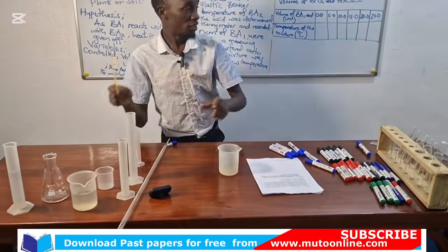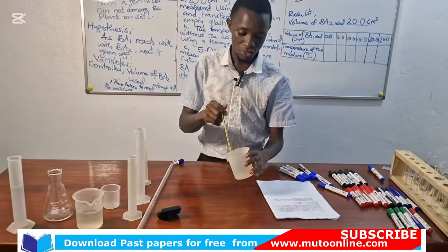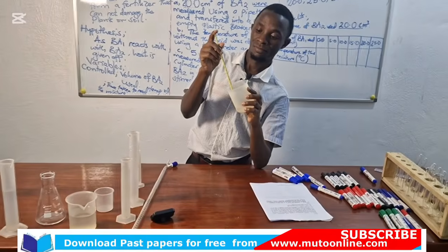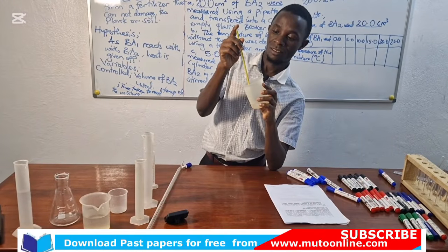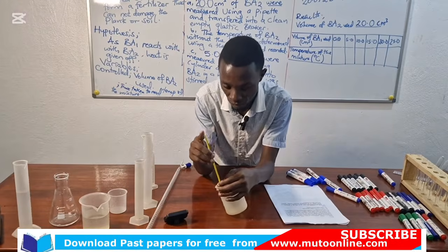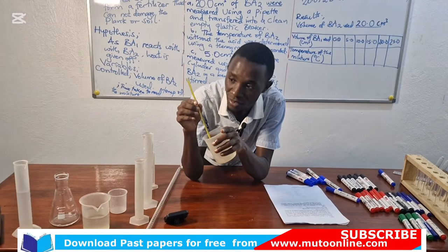We said the second procedure, we are going to use a thermometer to determine the temperature of this BA2 without the acid. So from my readings, I'll give it time until the thread of the alcohol in the capillary tube is stable.